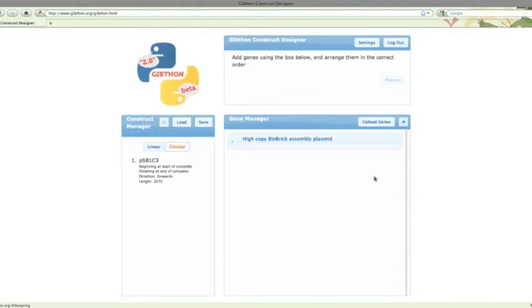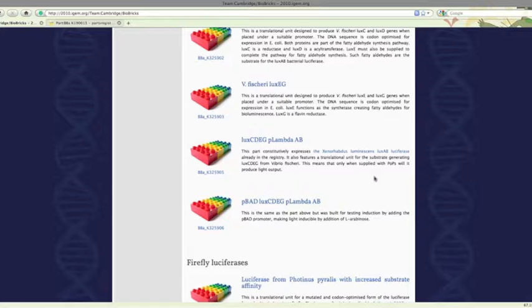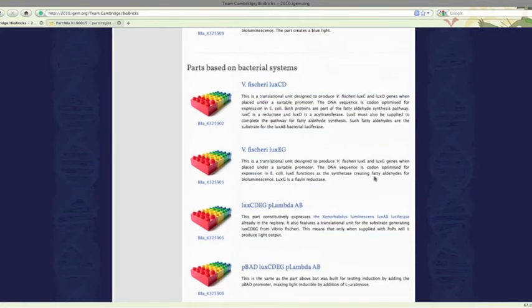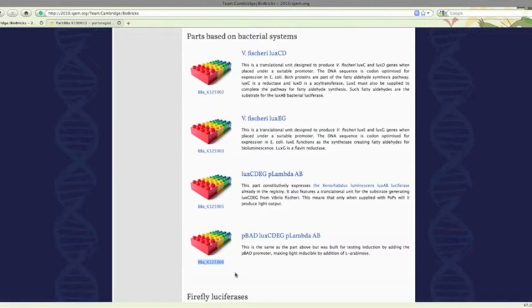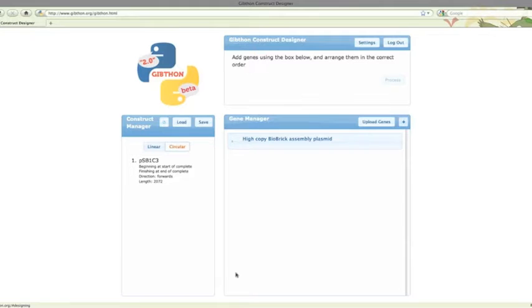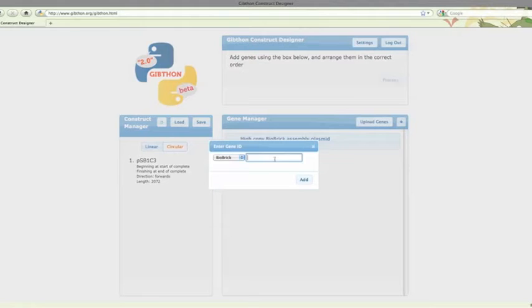Next, let's add the lux genes. If we go to the team wiki, we can see a nice list of all of the parts. Here's the one we want. Just copy the ID, put it in the box, and it's added.